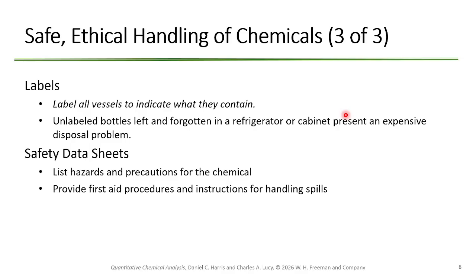Okay, and what else should you have on it? Okay, we have the date it's made, what it is inside of it. The last one is who's responsible for it. If you need more information about it, who can I talk to?